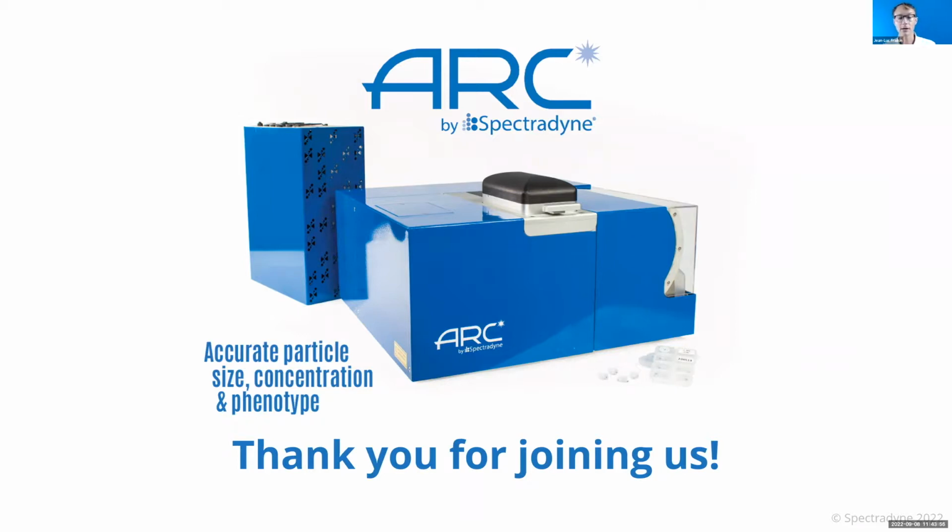There's another question in here. Can we get a distribution of particles that are double or triple positive? The answer is yes, because we can do fluorescence detection in up to 3 channels at once. So we could characterize positivity in, say, a FITC configured channel, a PE channel, or an APC configured red, deeper red channel also.